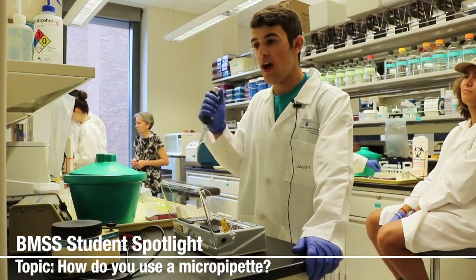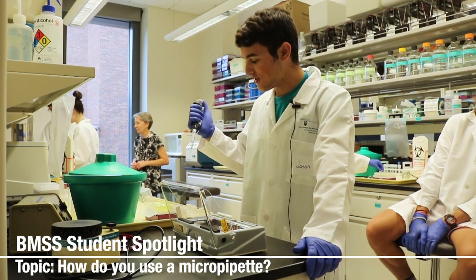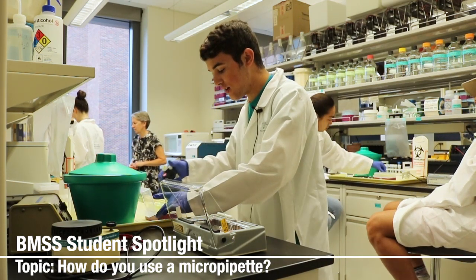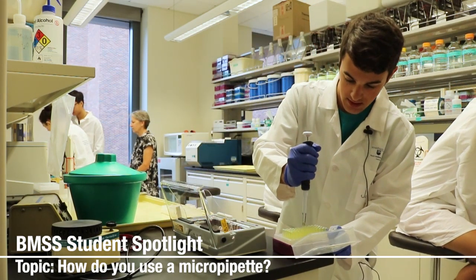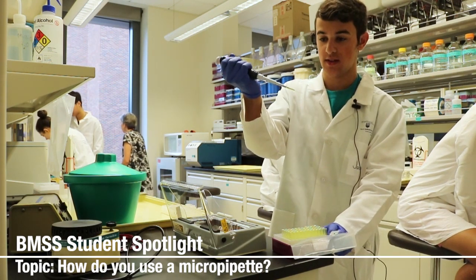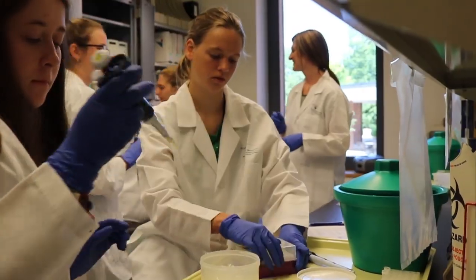Today I'm going to show you how you can pipette. What we've got here is a box of sterile pipette tips. You just take that, stick it in there, and it sticks on. Close that for now because you won't need it, and set it off to the side.